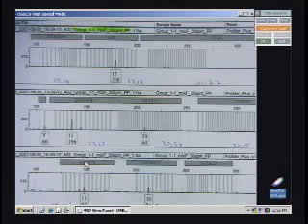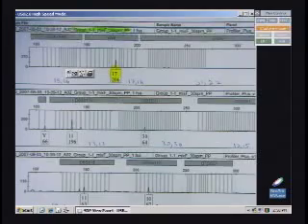So, let's see, which ones did you get right? You did get the 17. That's good news. Where'd you get the 11 from? Unfortunately, we also didn't have time to look at the raw data to see if the 11 was maybe some other artifact in the electrophoresis.